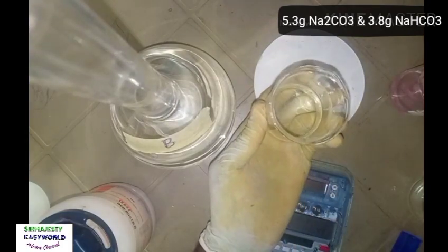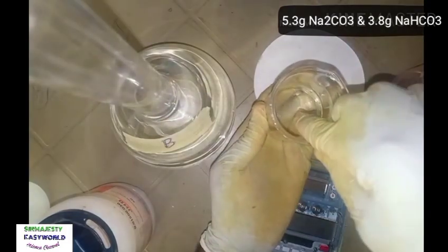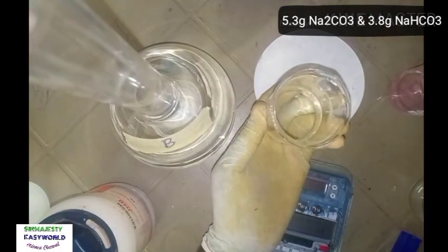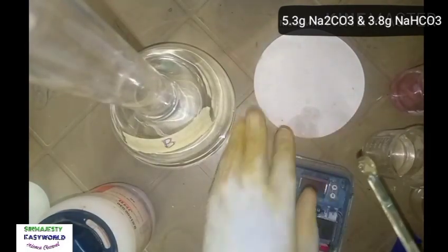Then bring the 5.3 grams you measured separately and pour it here, and bring the 3.8 and also pour it inside, along with half of 500 ml. You use your glass rod and stir well. You keep stirring until the two dissolve. When the two dissolve, remember you have filled this to half. You did not come to the mark, which is 1000.